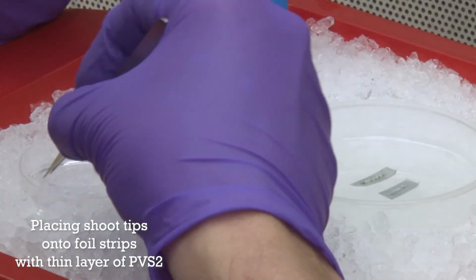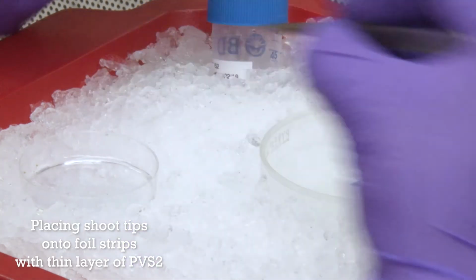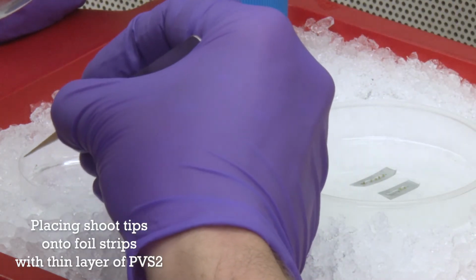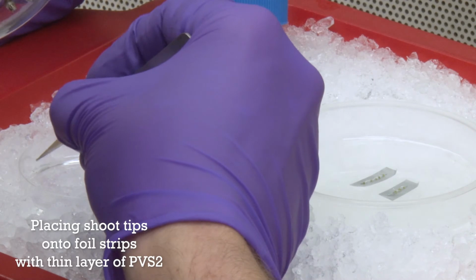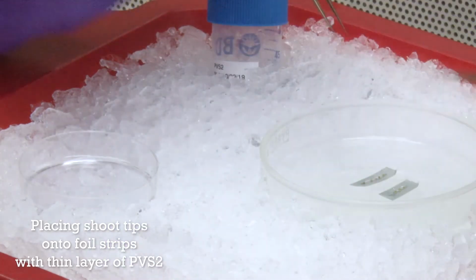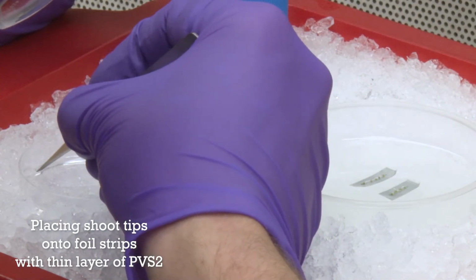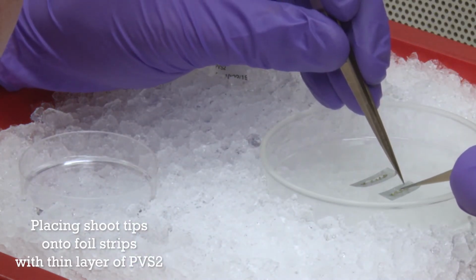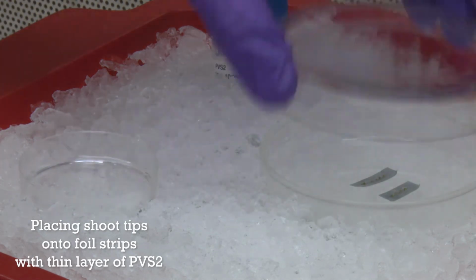And now we are transferring the shoot tips from the PVS2 into the droplet or droplets, being very careful to handle them gently so as to not damage them. It's easier to just lift them out of the PVS2 instead of trying to grab them with the tips of the forceps and risk doing some damage.